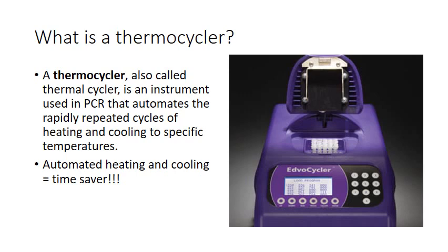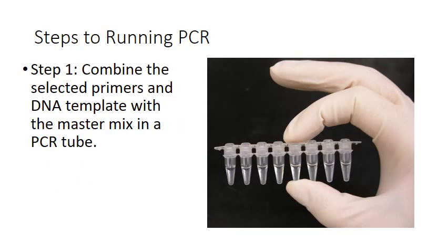Glorious piece of equipment. All right, so that is essentially what a thermocycler is. All right, so every lab should have one.